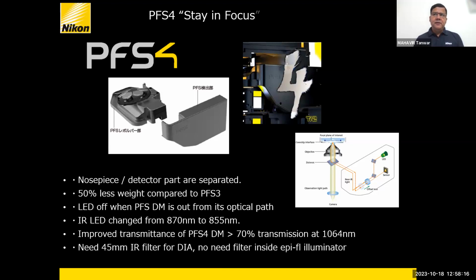First, the temperature of the room changes, and secondly, if somebody just barged into the room through the door, that will change the pressure of the room. So that will affect the sample focus. So with time, the focus will get drifted, and at the end of the day, you will see that my sample is not focused, and the live-cell experiment just got wasted.